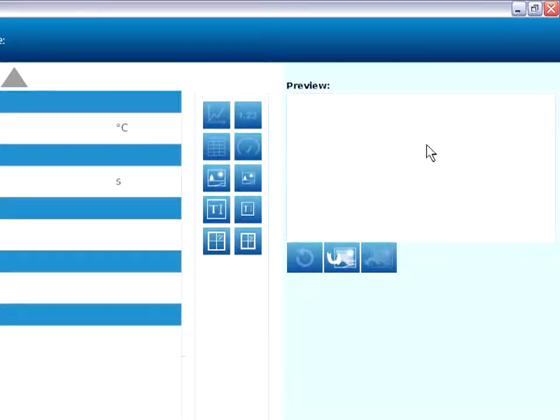Finally, on the right 1/3 of the page, we see a preview window. This page is going to fill with the page elements as we construct the page. So I'm going to start by creating page 1, and we have 2 page elements on this page. You may recall a large image on the left and a small text box in the upper right. We generally construct SPARKLab pages from upper left to lower right, so I'll begin by adding a large image.